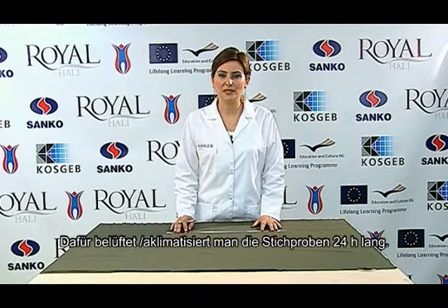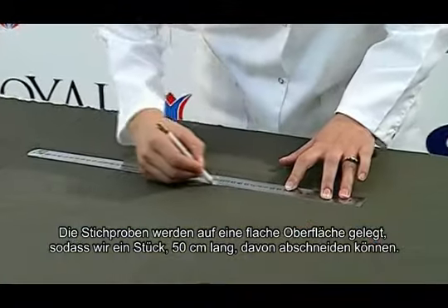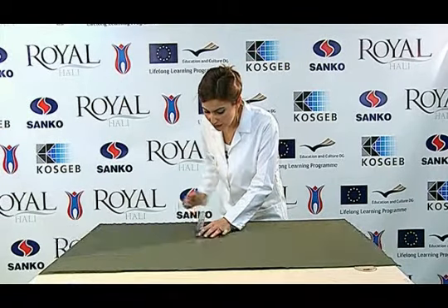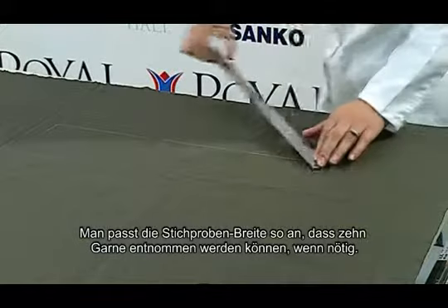The sample is laid on a flat surface so that we can cut a part of 50 centimeters long from it. While cutting the sample, we pay attention to take from 150 millimeters inside its edge. We adjust the sample's width so that 10 yarns could be taken out of it when needed.